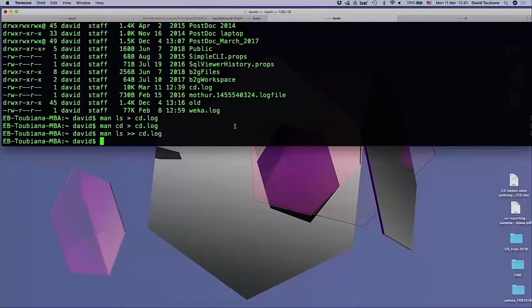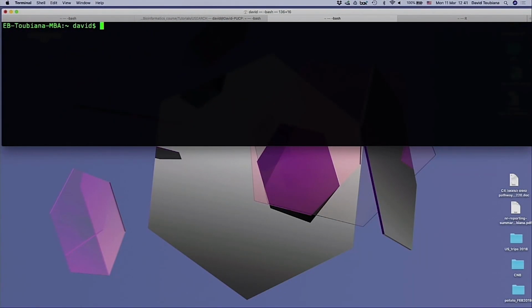Now, you saw that you can start R by just typing R, but there's also the option to execute a file from your shell script. Let's say you have a file of R commands and you want to execute it from your shell script, you can use the command Rscript. You can pass arguments to your R file. Later on we'll see exactly how to do this. But again, if you're working on a server, this is how you will need to execute your R script. You will not have the option to run RStudio on your server.